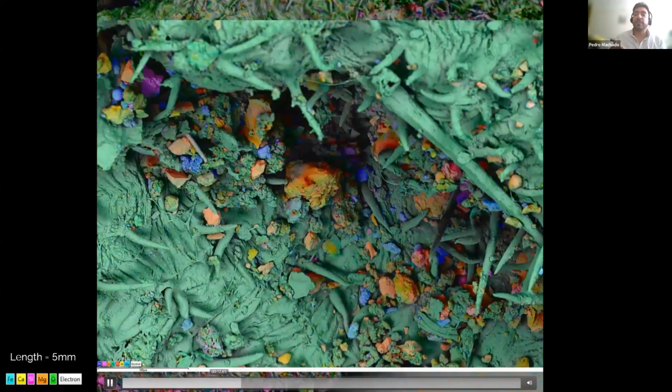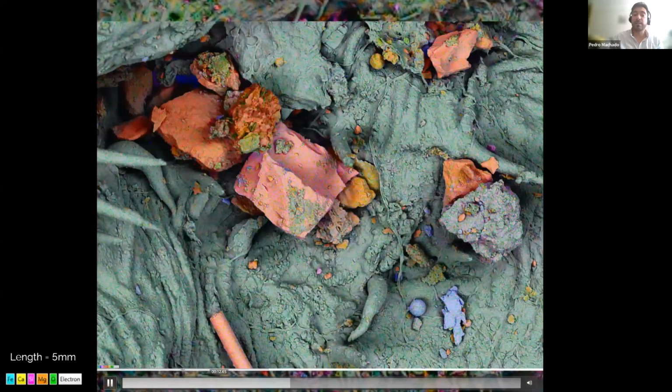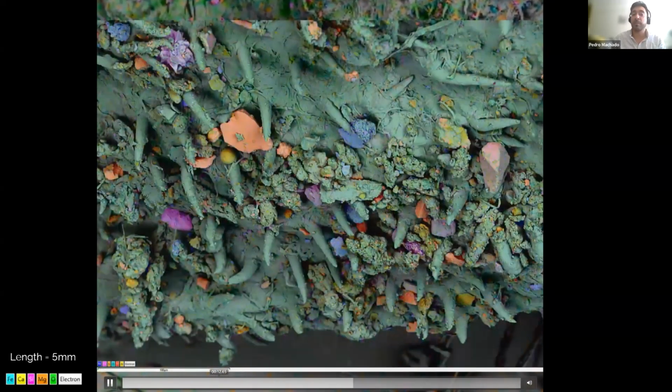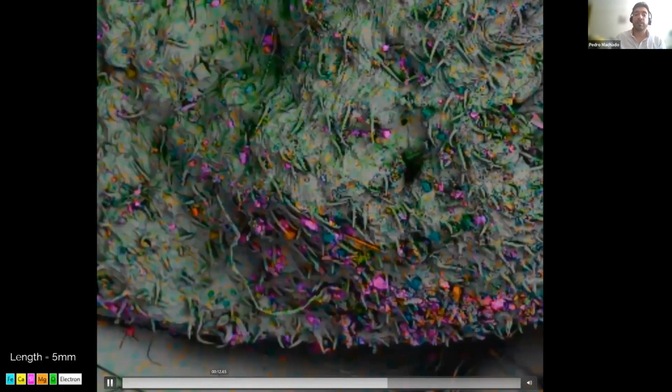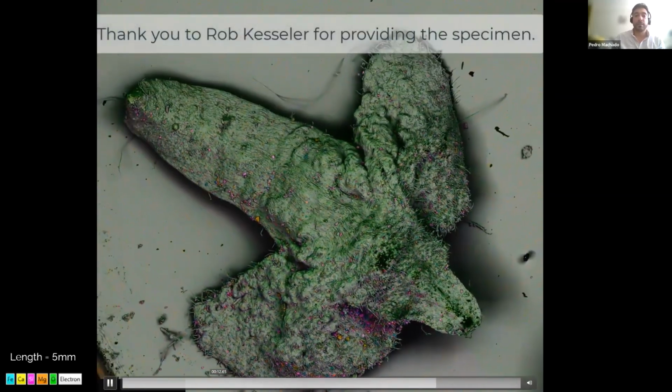And here it was taking advantage of BEX to image a millimeter size sample that has a complex topography, but because of the geometry of our BEX detector, we don't have almost any shadowing collecting the BEX signal, and you can quickly target in higher resolution regions of interest that you can identify using the quick screening.